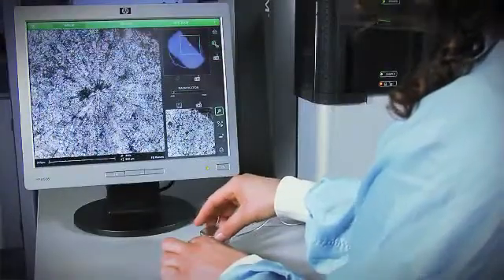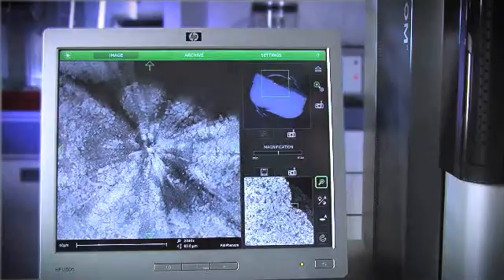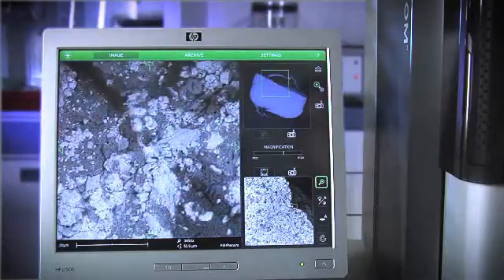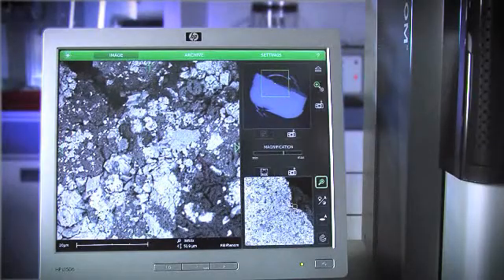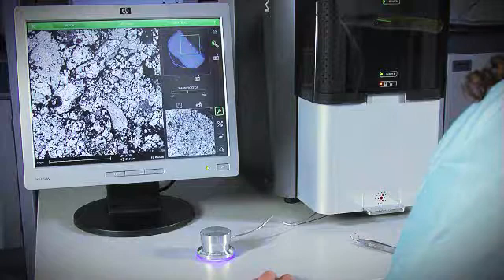Focus and intensity are automatically adjusted. Image magnification is adjusted by the rotary knob. Digital images are stored with a choice of pixel resolution and data format.